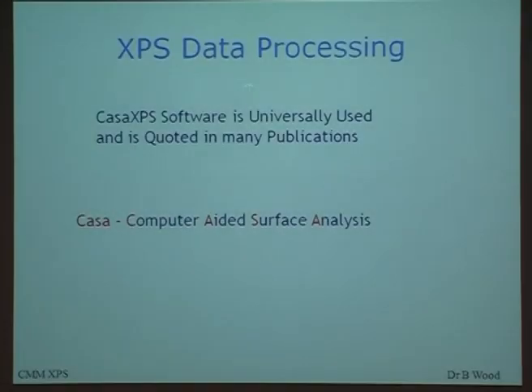So this CASA XPS stands for computer-aided surface analysis. It's used a lot by many people around the world. You'll see it quoted in many publications. We've got a university academic license to put on any computer at the university.